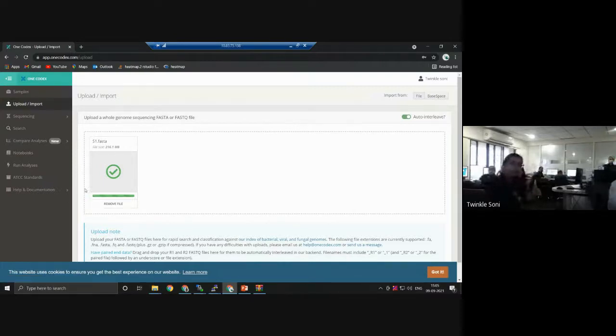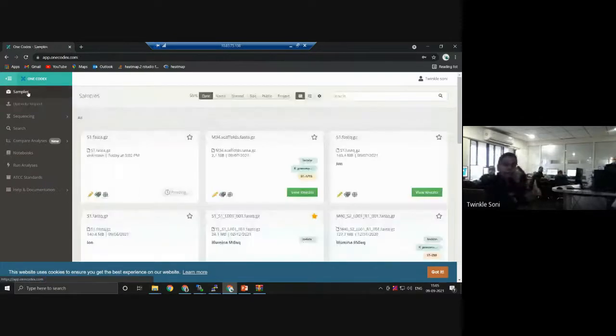So over here, the data has been successfully uploaded. In samples, you can see this file. They will analyze it themselves, to see what exactly it is, a metagenomic sample. So no community is in abundance, or none other community is. If I am having a particular strain of bacteria in which I am analyzing my AMR, that particular DNA or that particular bacteria should be the most abundant bacteria in my sample. That's the case which Martin ma'am even told, that we should have a pure DNA sample. If not, like for a metagenomic sample, we don't have a particular DNA, we have a range of DNA. So in it, no community will be in abundance.